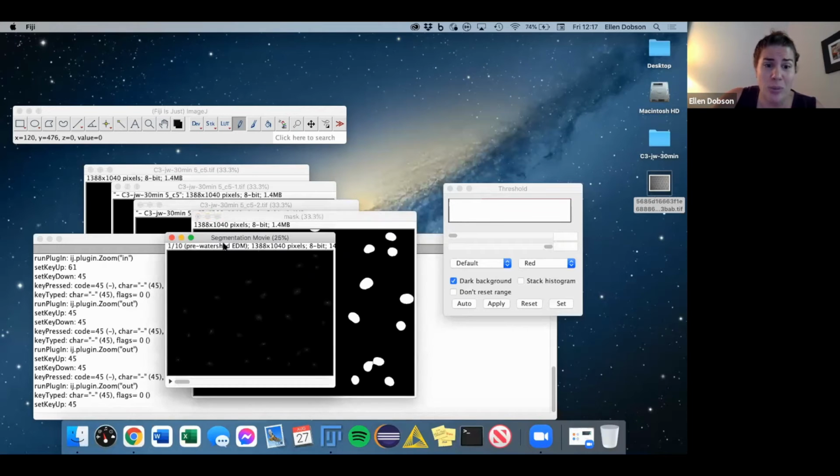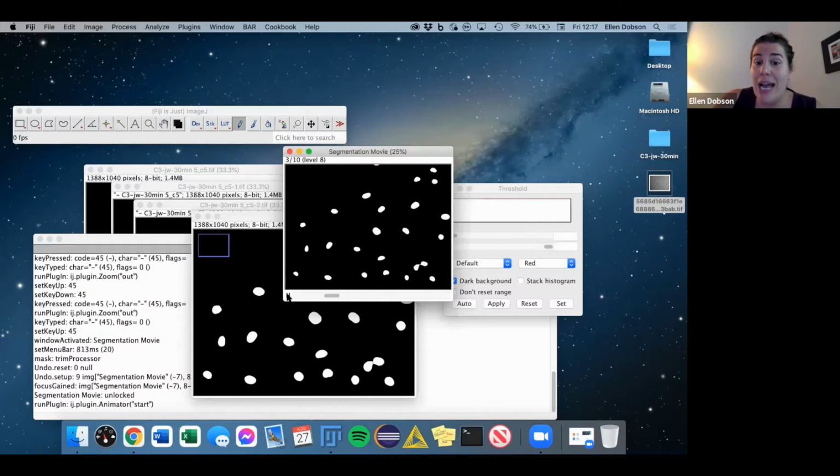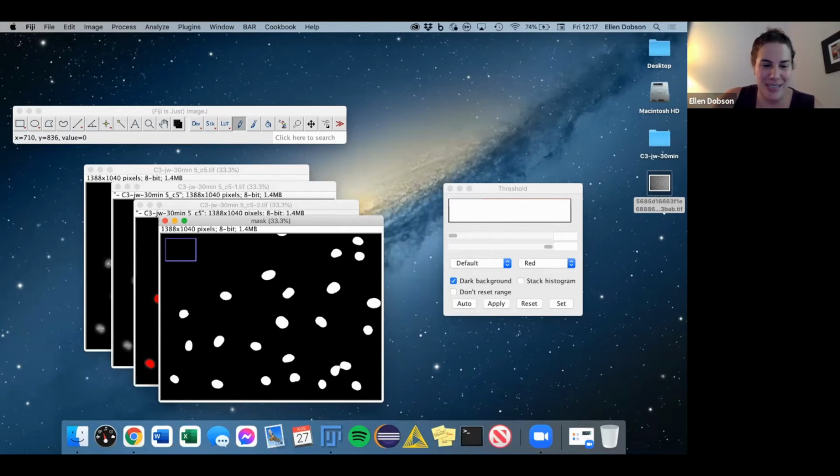And since we ran it in debug mode, this little video popped up. This is showing us how the regions grow and how it's selecting the cutoff region in those two blobs. So just kind of a fun thing. You can visually see how Watershed is working. You don't have to run that when you're actually just doing watershed. It's just for us to see.